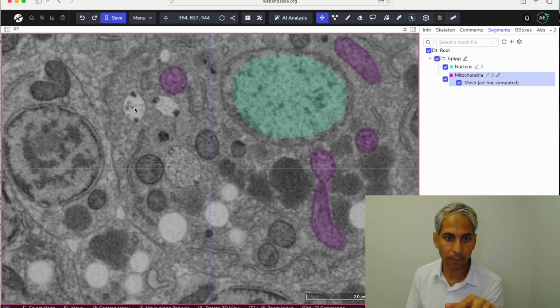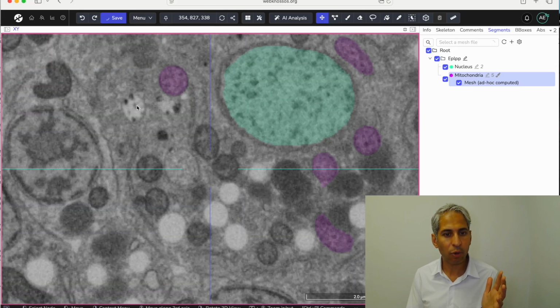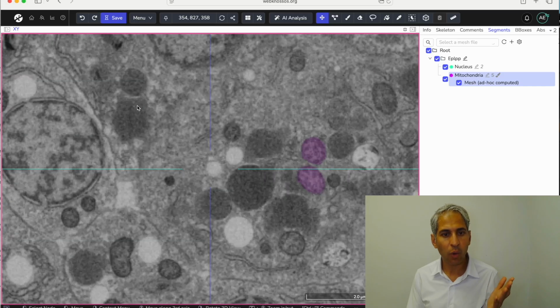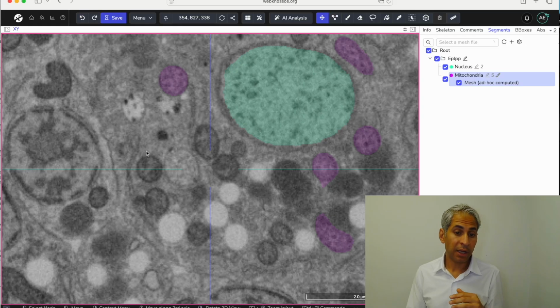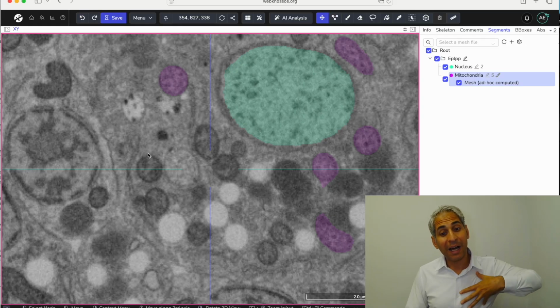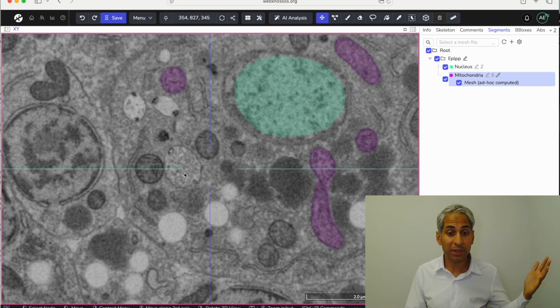Look at this, for example. It has a different shade of dark gray as a membrane than the mitochondria, which is much darker. And then inside, look at these two dark parts. I don't know what this is. This is actually one of the things I'm hoping we can answer through this project. What are these things? They're not mitochondria. Based on what I am familiar with regarding mitochondria, maybe they're an alternative kind of mitochondria. I don't know. We're going to have to do some digging.